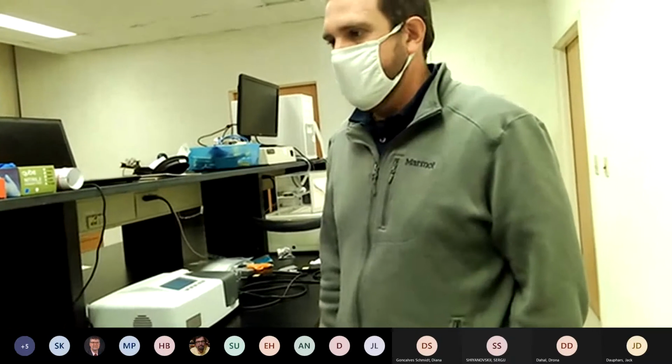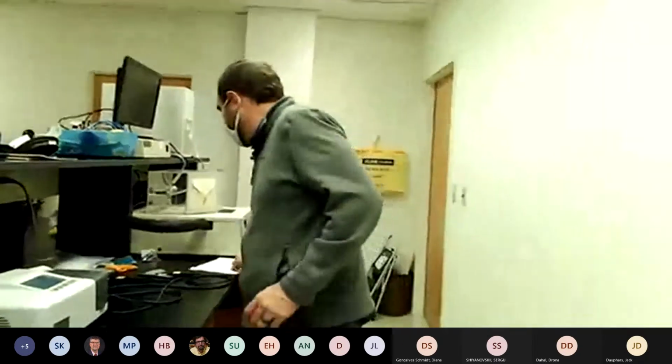Yeah, we'll need to look into that more because nobody mentioned that to me. Typically, it's the rheology team that we work with to do those. We have him here. So our product expert would likely have to come out and do that rather than our normal install. So we'll relay that message as well. Okay.